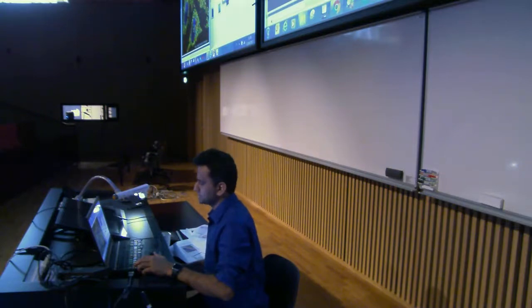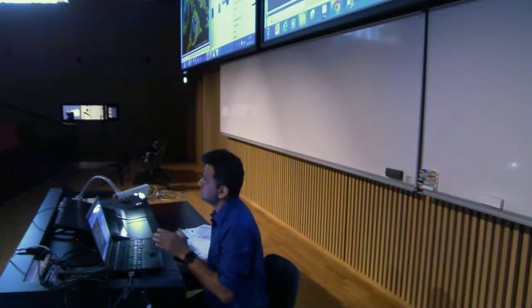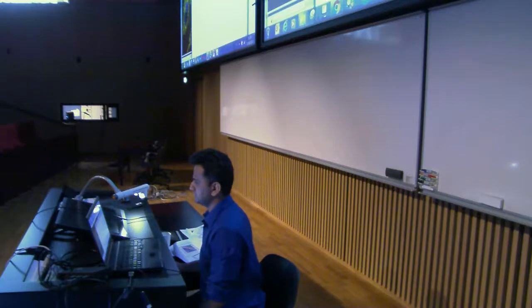The point is that I can also select two regions of interest, go to more, and say AND operation. This is basically co-localization, right? Co-localization based on area. If I want to know how much area is co-localized in these two channels, that's possible. So say AND operation, and then go to measure. Now there is this AND operation.